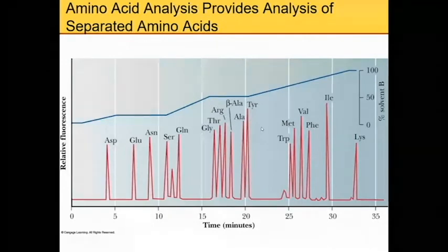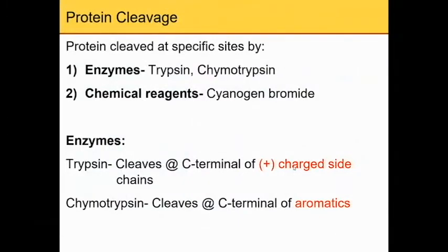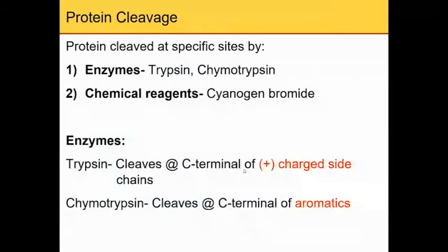And so this is the amino acid analysis, AAA, so that you can see the presence of the individual amino acids, and the protein cleavage, all right, protein cleavage. And here are the protein cleavage steps.